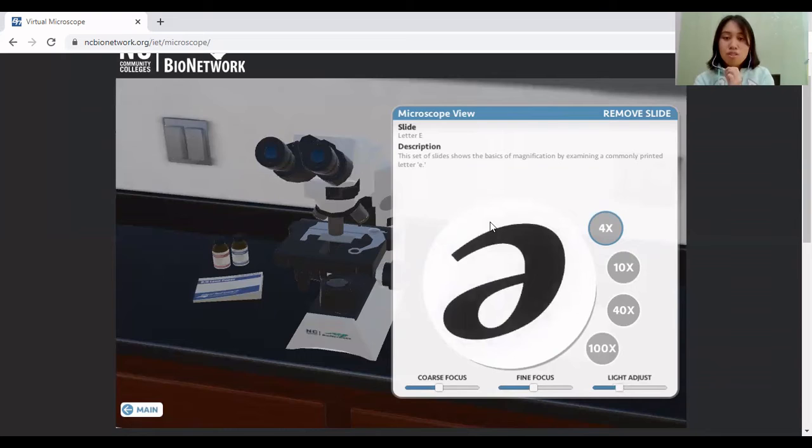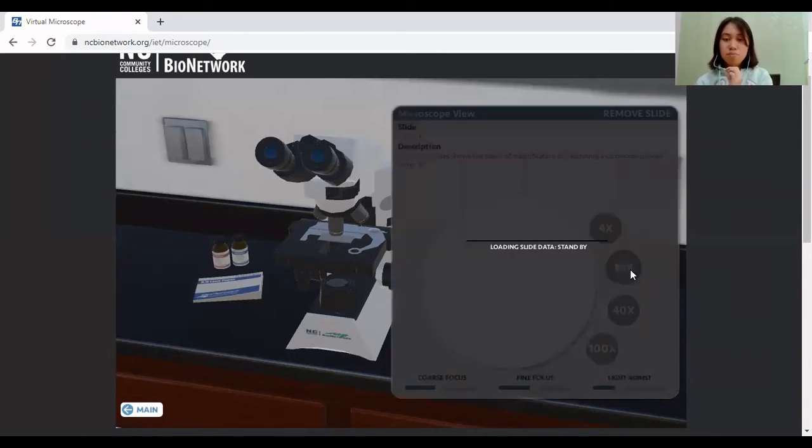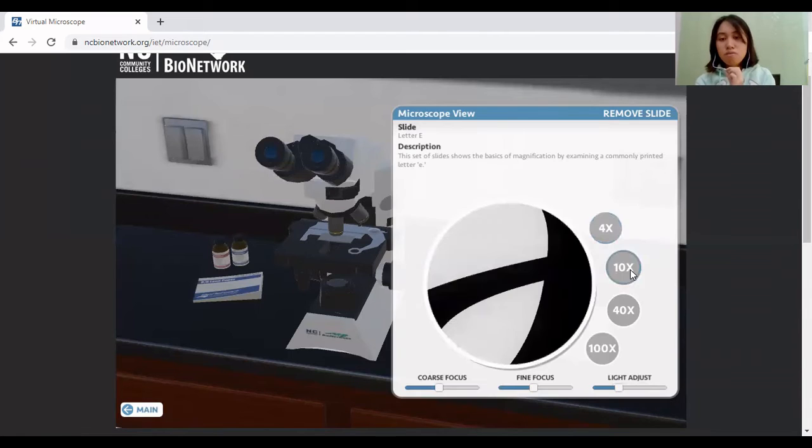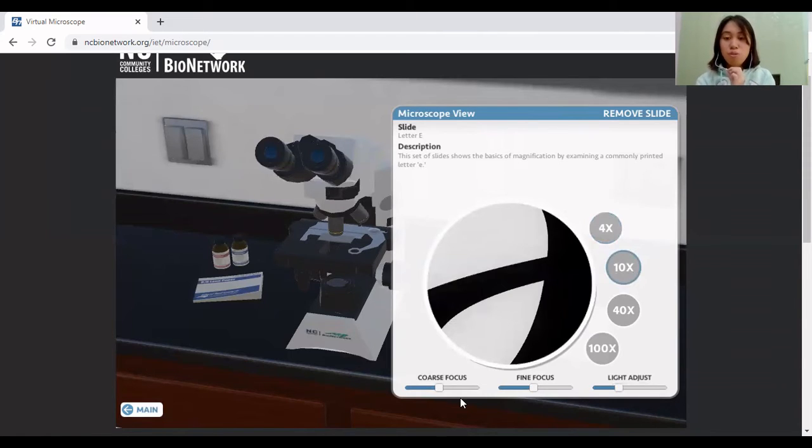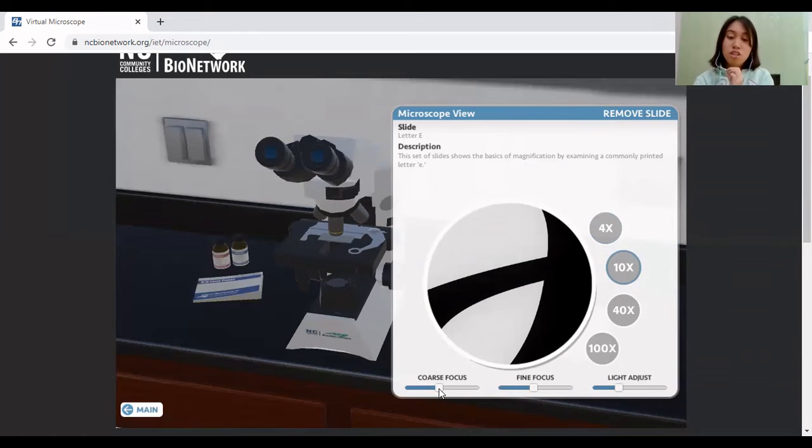So after 4x or the low power objective, you will now move to 10x. So 10x is a more closer view of the picture, 10 times closer. Again, it's already adjusted, but you can still adjust it if you want, the coarse focus.